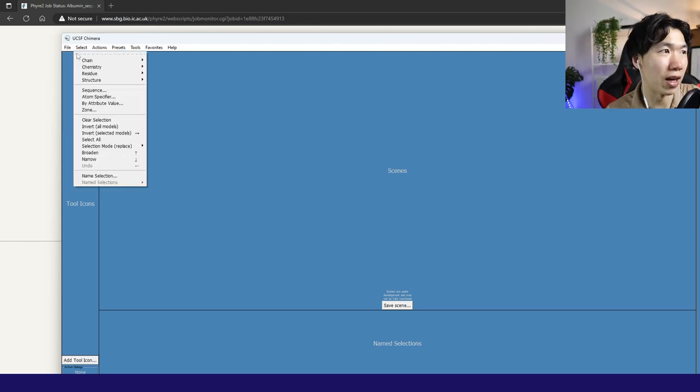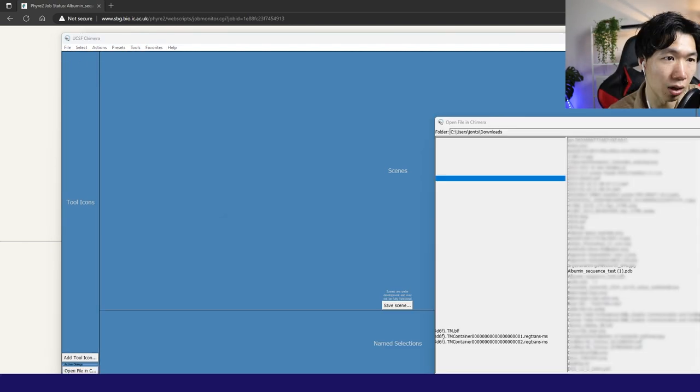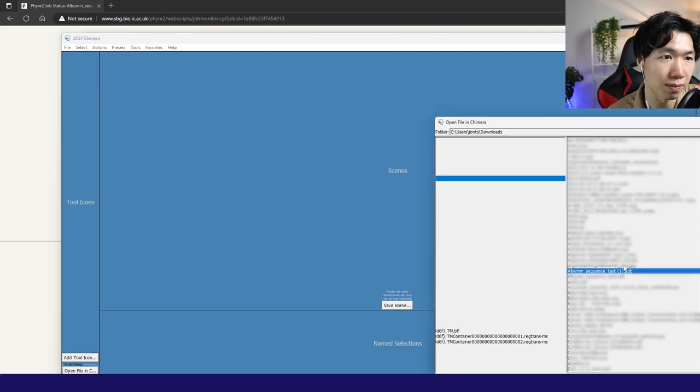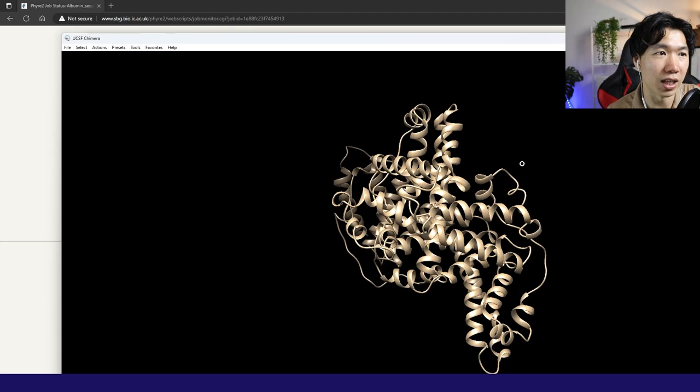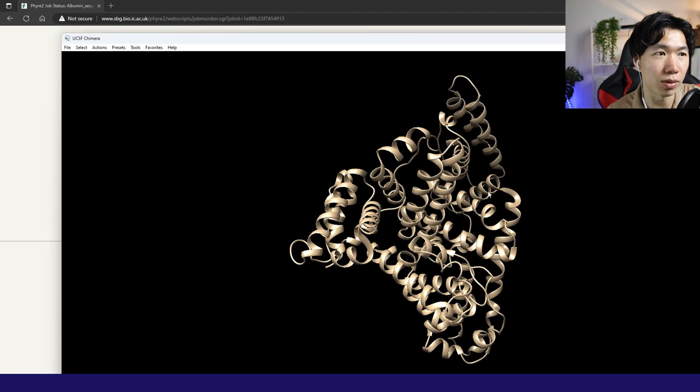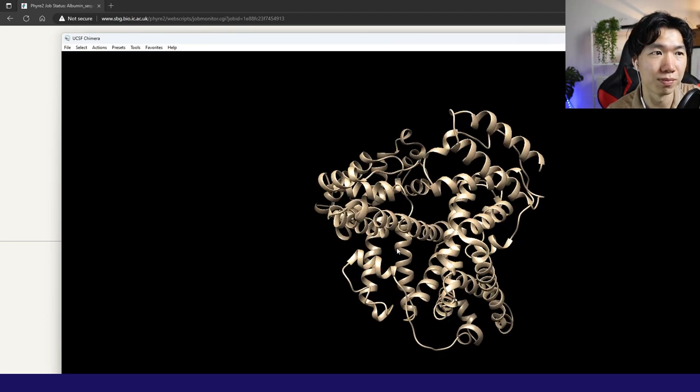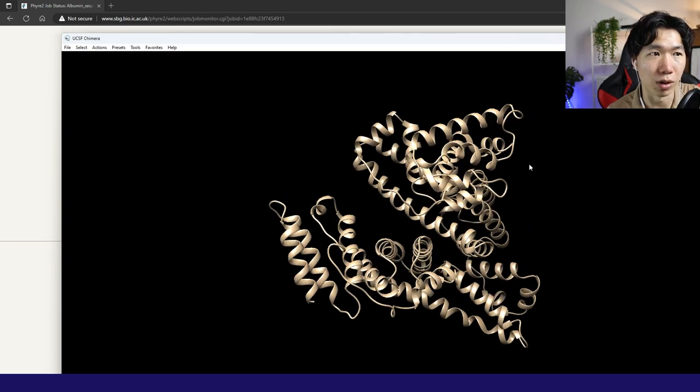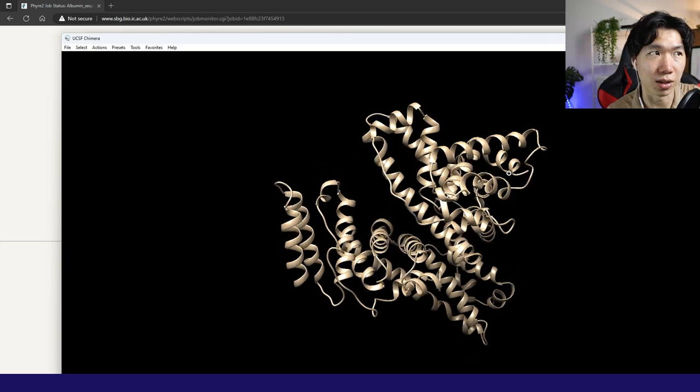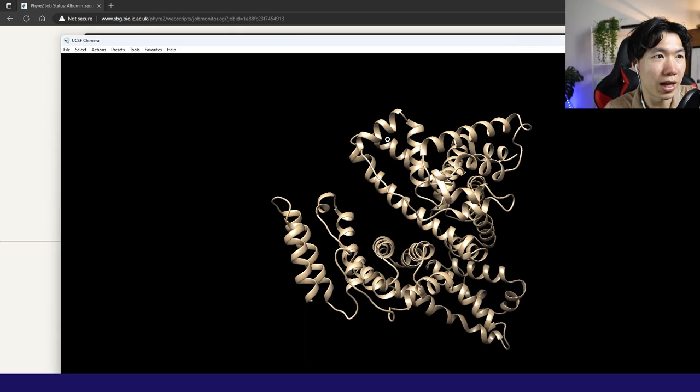Okay, now we go to file and open. Here, albumin sequence test. Let's open it. Then you get your protein 3D model that is generated from your amino acid sequence.